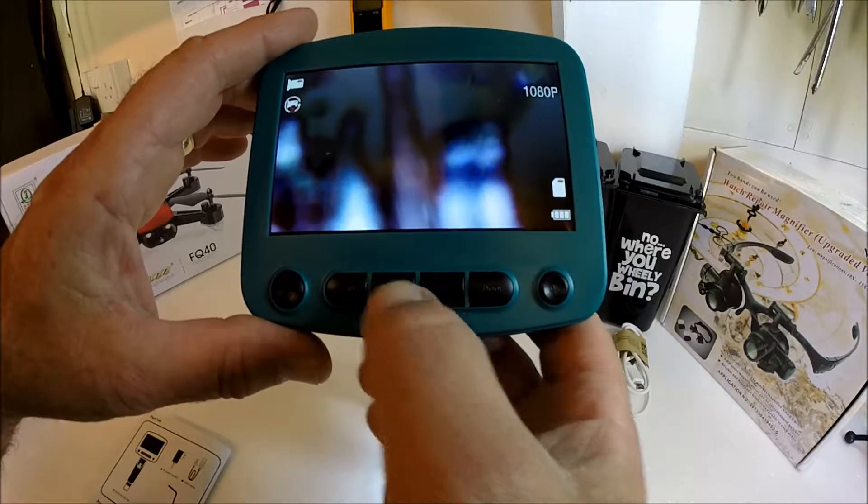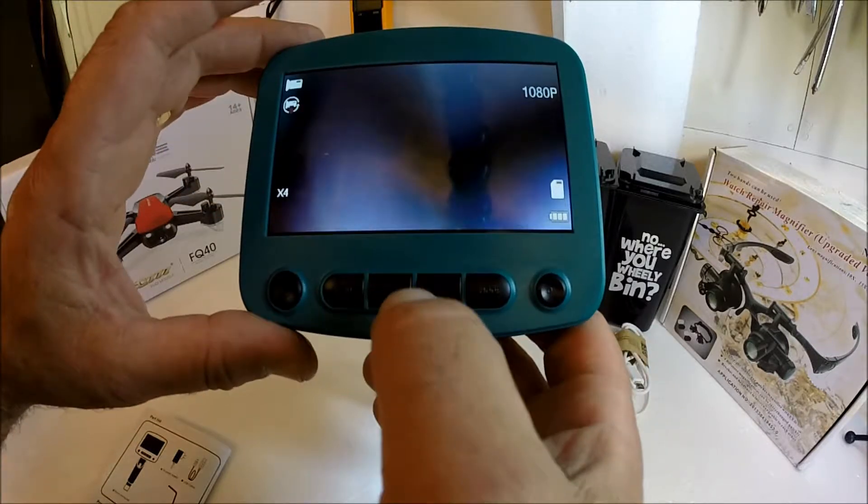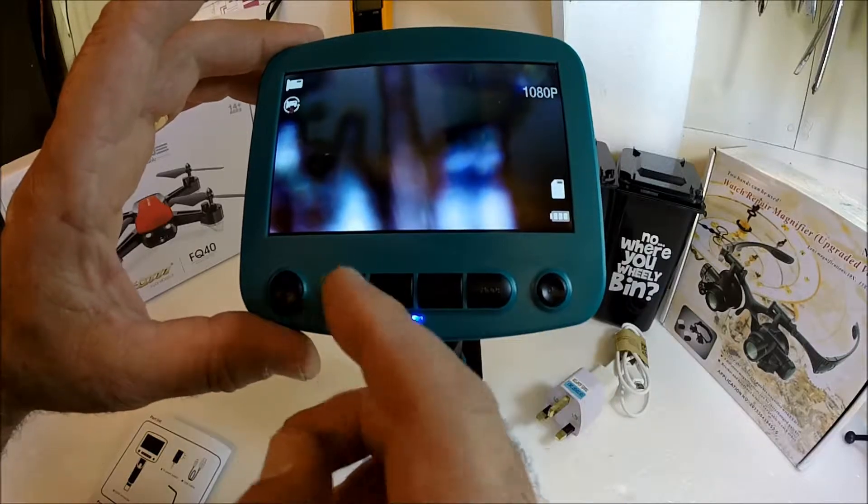This button here will increase the zoom up to four times. And this will take it back out of zoom.